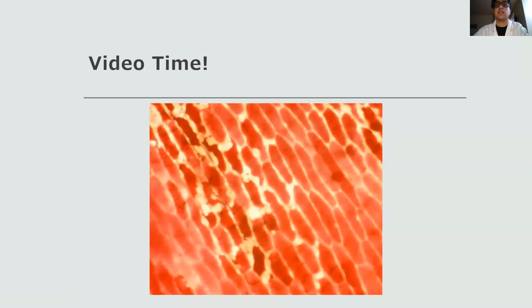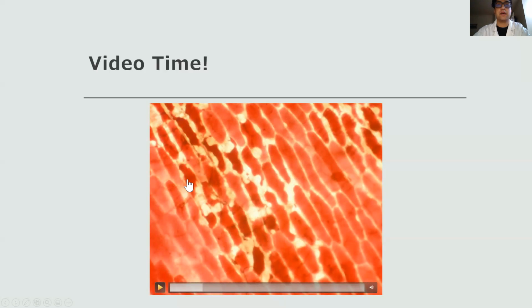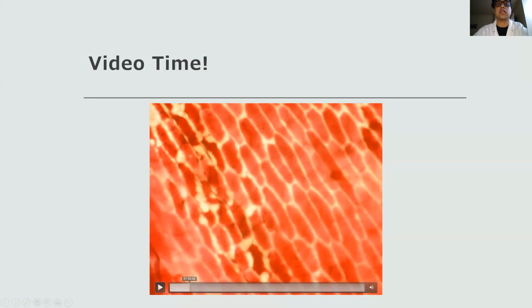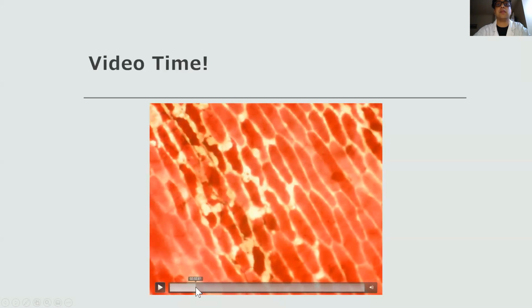So as you can see, the water is leaving the cells. These cells got shriveled up. Prior to this, they were all normal. As you can see, they shrink in size, they get all shriveled up. What does this imply? Maybe pause the video and take a moment. Explain to me what you think is going on. What's going on here? So hopefully you paused the video.